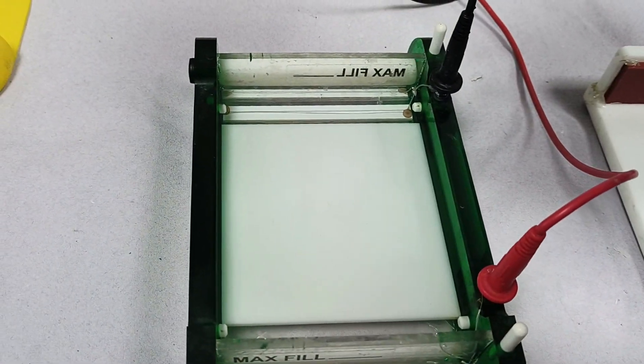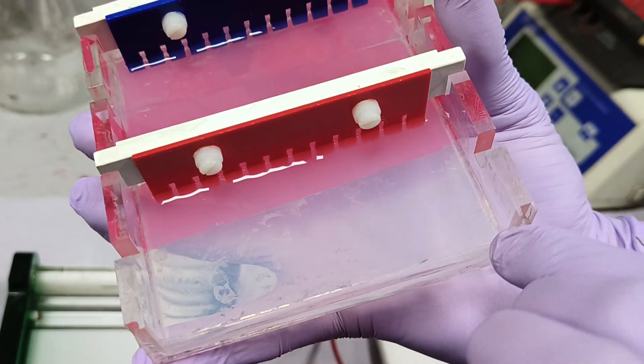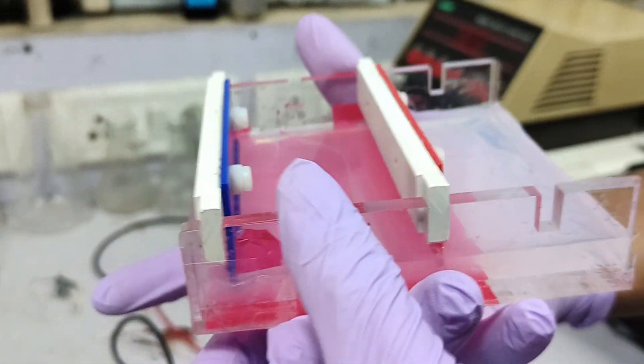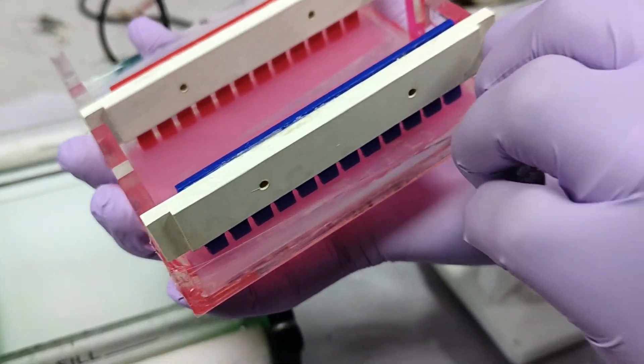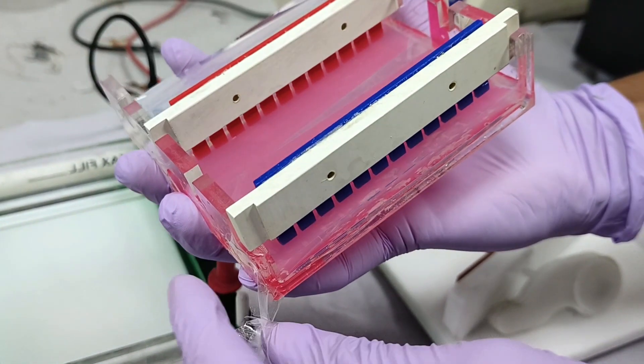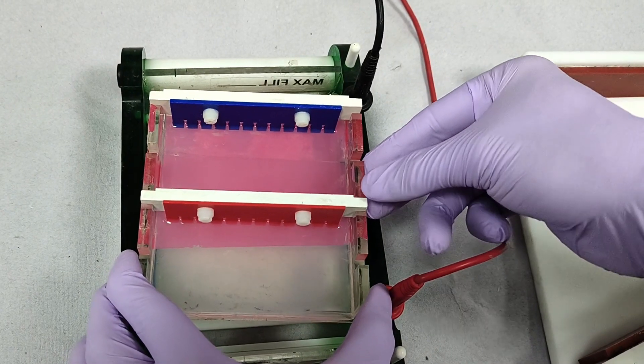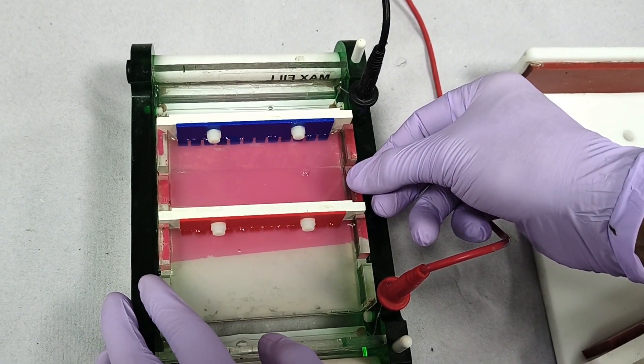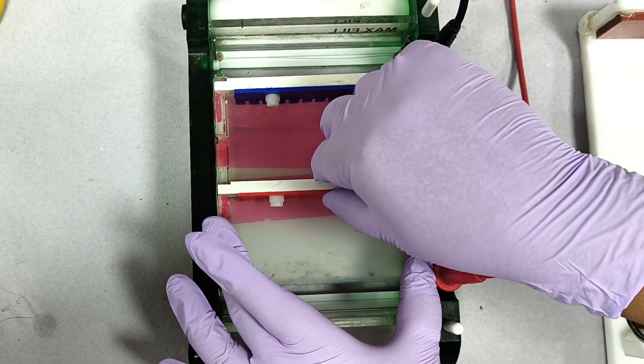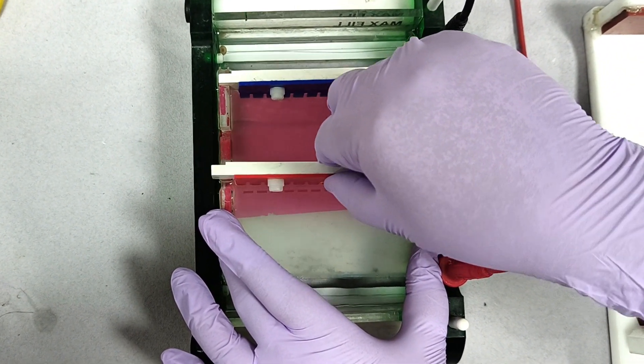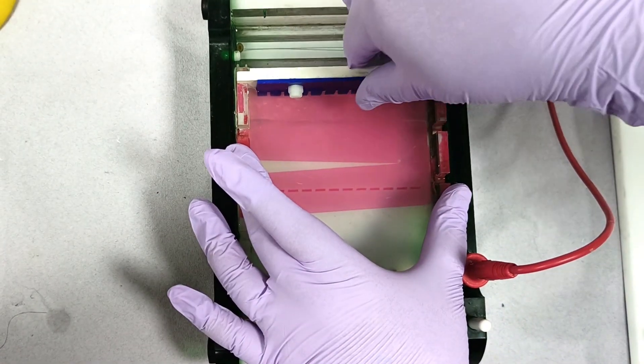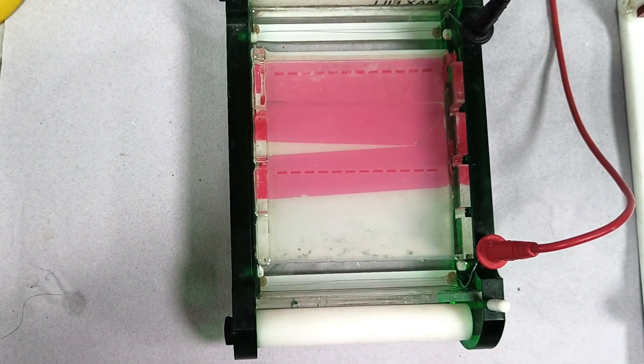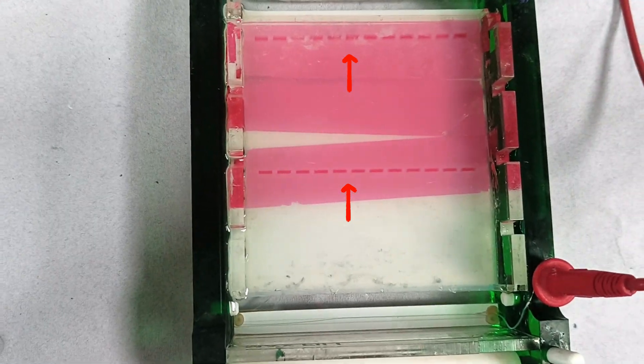Once the gel is solidified, remove the tape from both ends of the casting tray. Generally students forget to remove the tapes before running the gel, this may hamper their experiment. Now place the gel in the tank filled with 1X TAE buffer. The wells should always be near the negatively charged cathode and then carefully remove the combs to avoid any damage to the wells. This is how the wells look, as you see here the wells are formed nicely.